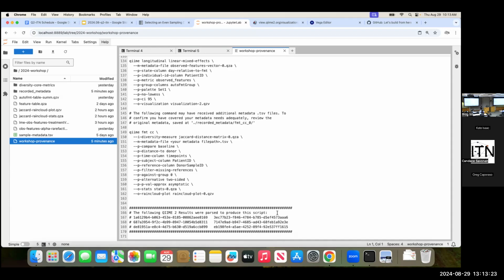They're used all over the place on the internet, but they're basically like database quality identifiers, and they're not guaranteed, but they are effectively guaranteed to be universally unique. And so you will never generate another QIIME2 result that has this same identifier, nor will anybody else in the world. And if you rerun a command and regenerate a result, it's going to have two different UUIDs.